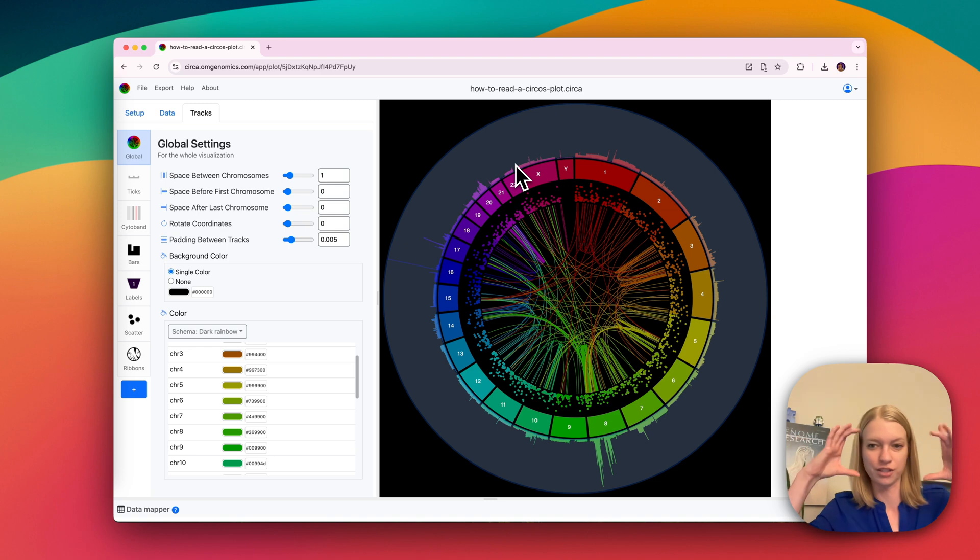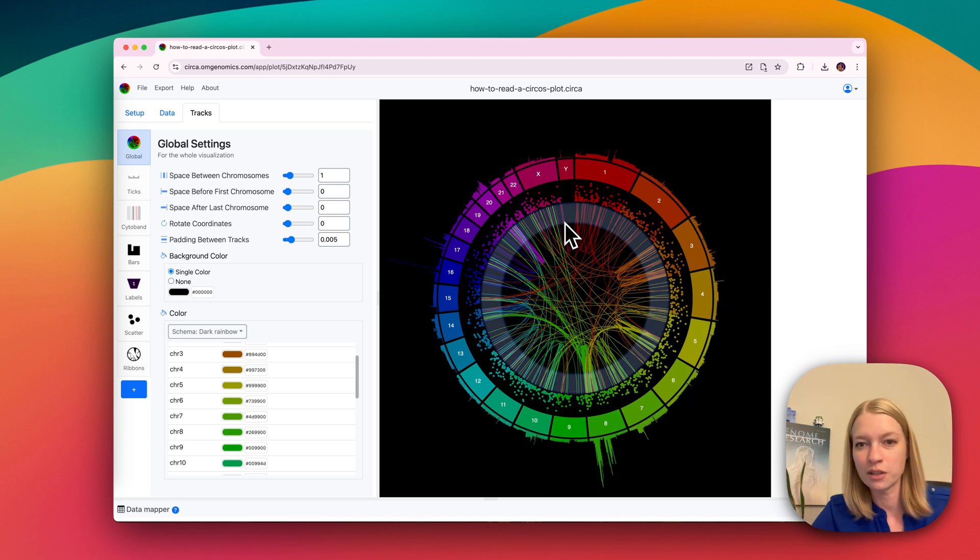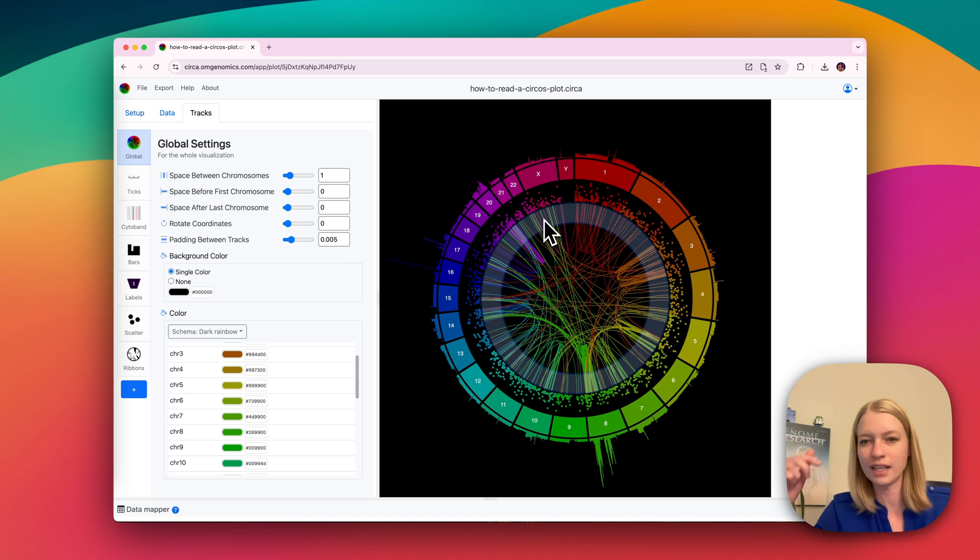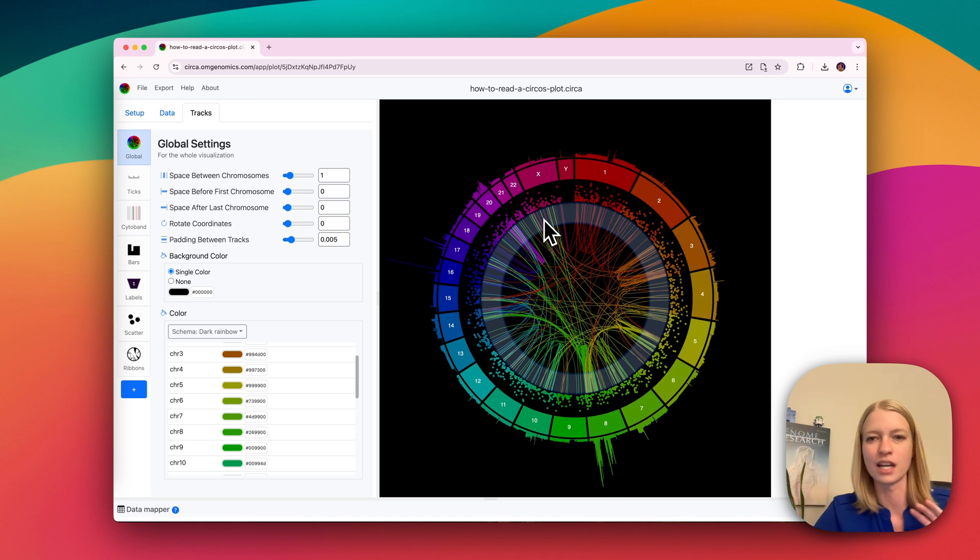So these are concentric circles, and there'll often be a track in the middle that contains some connections and things like that.